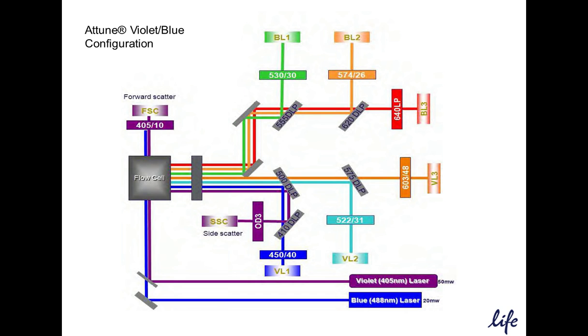Here is a different configuration. This demonstrates a more complex pathway using 2 lasers, 2 scatter parameters, and 6 fluorescent detectors.